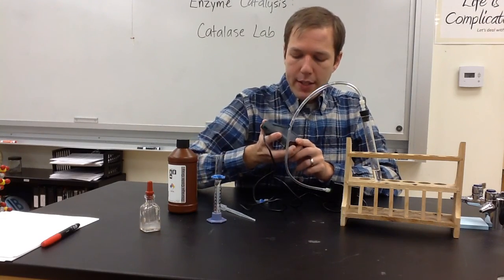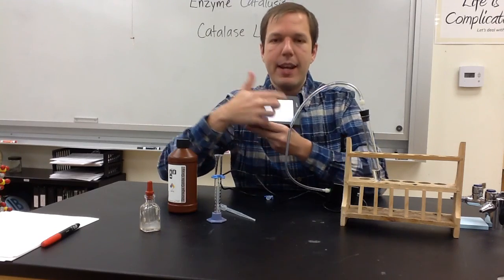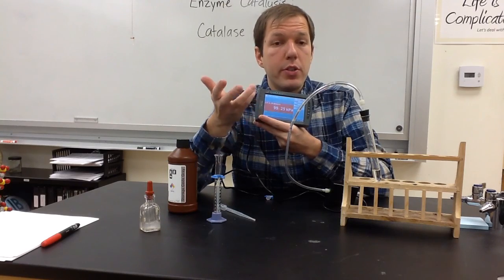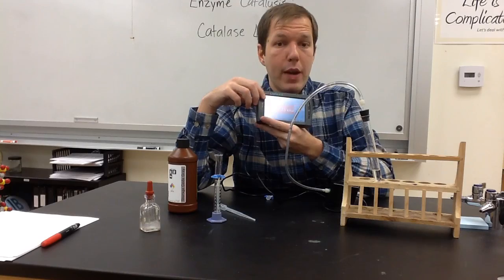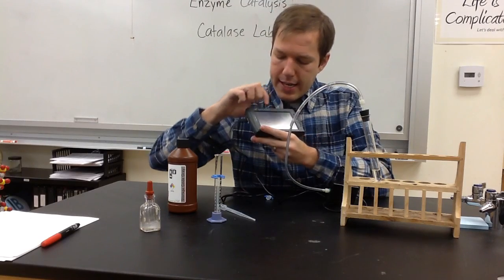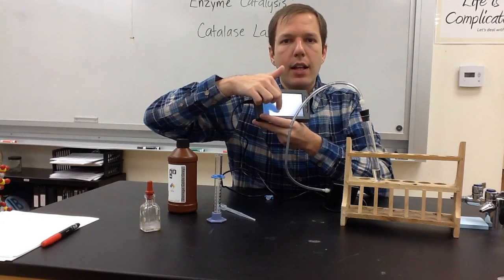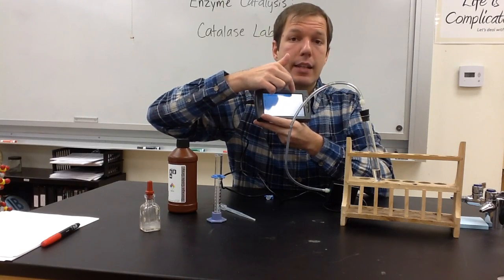Finally, once the data is collected, you're going to want to use the LabQuest to determine what the slope of the line is going to be, because that's providing you with the rate. As you look at a graph of the data, you should see a line that is slowly or sometimes steeply increasing.